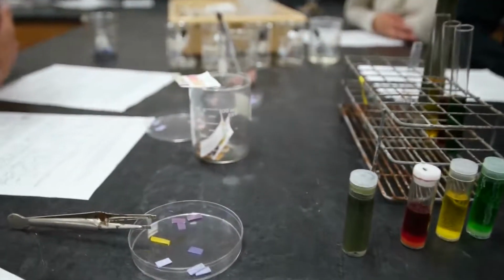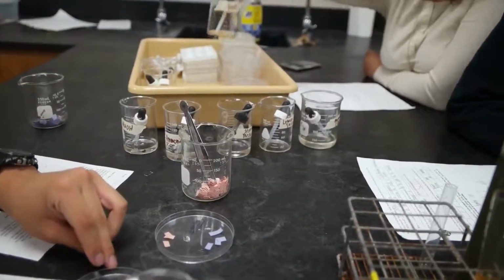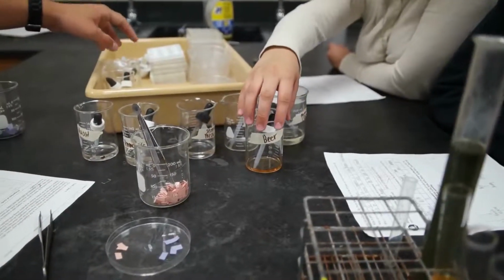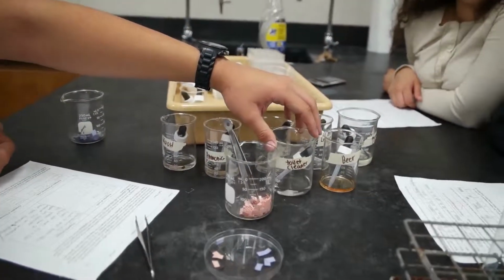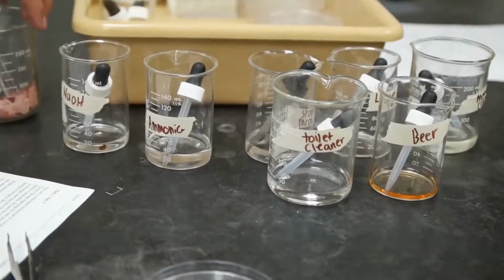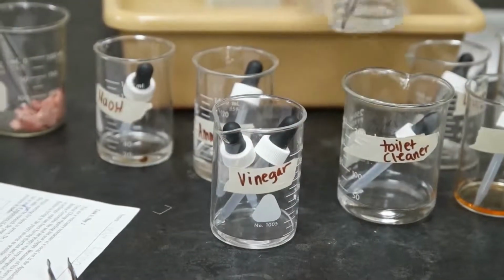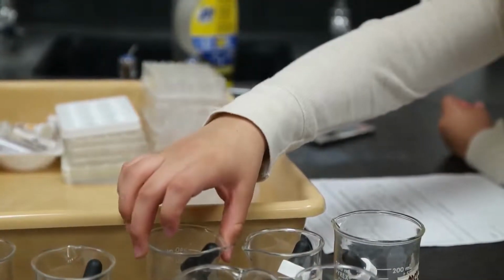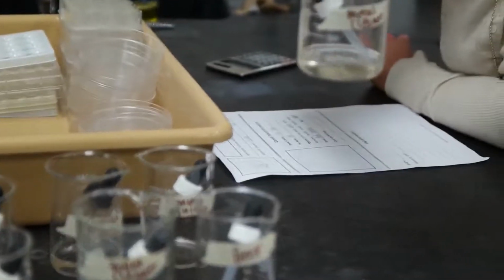What else do you have in those? These are just different chemicals that we were testing. There's also beer, and then there's toilet cleaner. Vinegar, also stomach medicine, lemon juice, and metal cleaner.